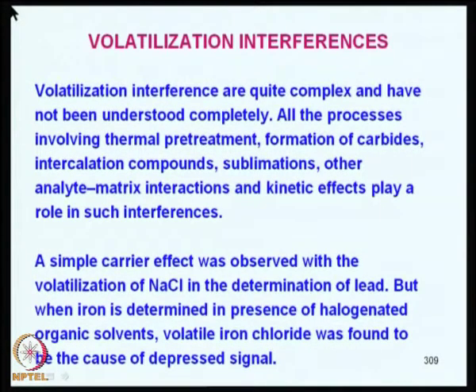So, let us talk about volatilization interferences. I referred to this when we were talking about sodium nitrate and ammonium chloride. The volatilization interferences are quite complex actually. They have not been understood completely. All the processes involving thermal pretreatment, formation of carbides, and then intercalation compounds, sublimations, and other analyte and matrix interactions, kinetic effects, they all play a significant role in such interferences, that is volatilization interferences.